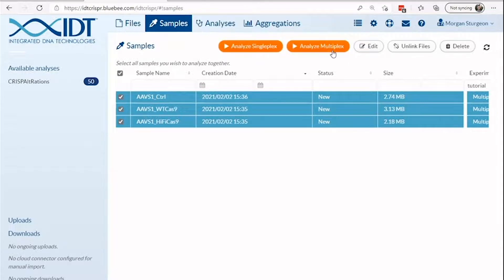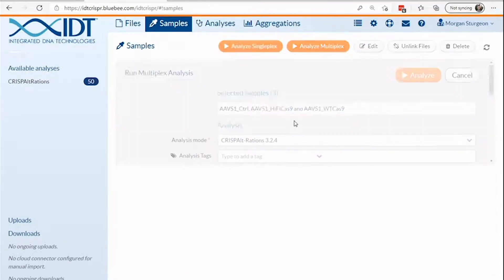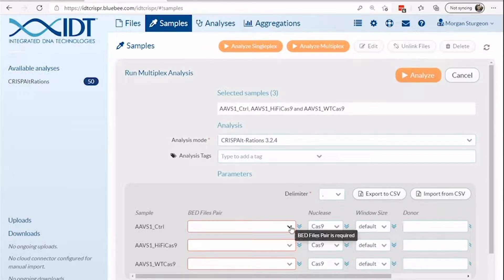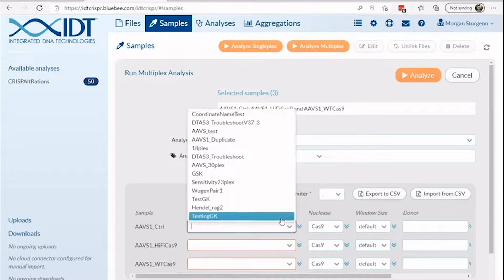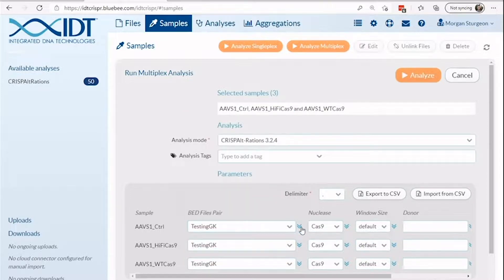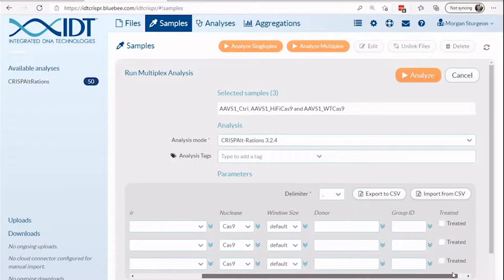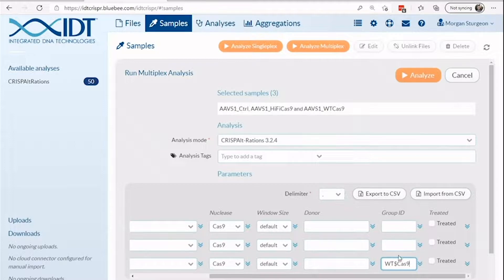To begin, select the desired samples and click the Analyze Multiplex button. To pair your guide and amplicon bed files, watch the video titled How to Quality Control Check Multiplex File Inputs. Once successfully QC'd, you may select your guide and amplicon pairs, and other relevant run information such as CRISPR nuclease used, the window size for interrogating variants, nucleotide sequences for HDR donors used, sample name information, and whether it was treated or untreated.